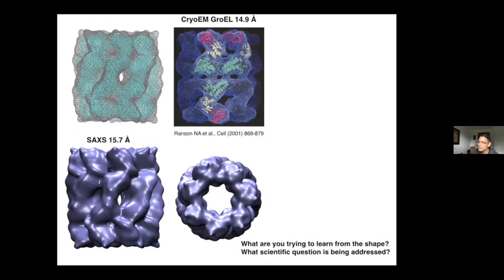I think what happens is, as you start to have little models that you can put in and start to arrange, maybe this is better as a guide to think about how to make larger aggregates or structures to test. Because then you could be thinking about, well, maybe I'm guessing at this interface. Does this interface make sense? Can I test that in solution?